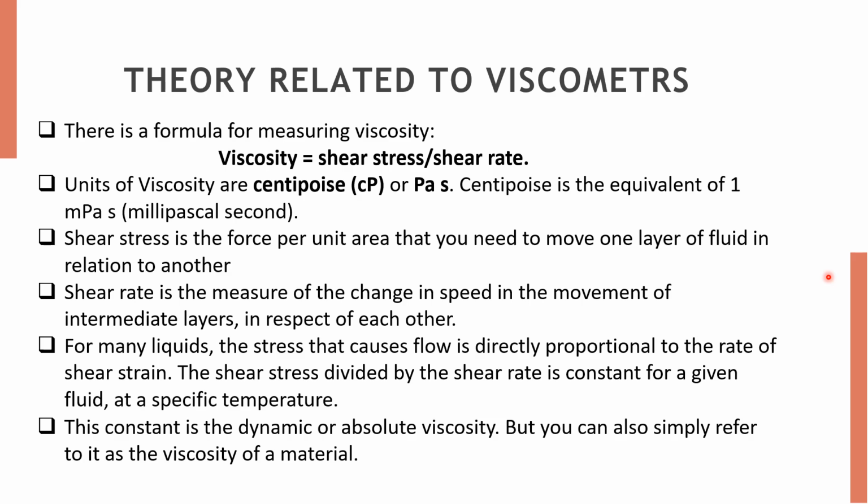Centipoise is equal to 1 millipascal second. For many liquids, the stress that causes flow is directly proportional to the rate of shear strain. The shear stress divided by the shear rate is constant for a given fluid at a specific temperature. This constant is the dynamic or absolute viscosity, but you can also simply refer to it as the viscosity of a material. There is another type of viscosity called kinematic viscosity. To measure this kinematic viscosity, we need a device called rheometers.